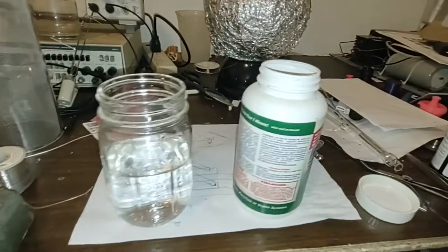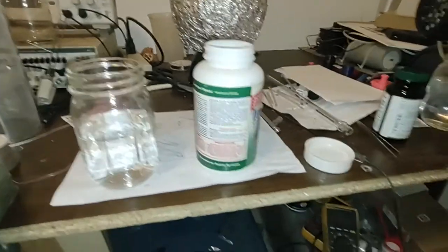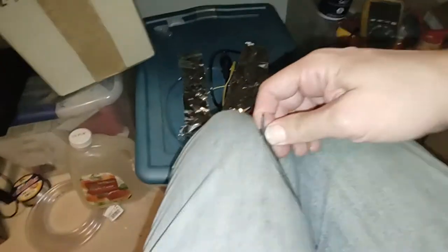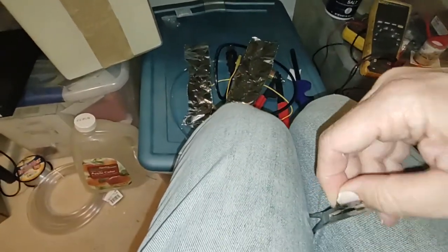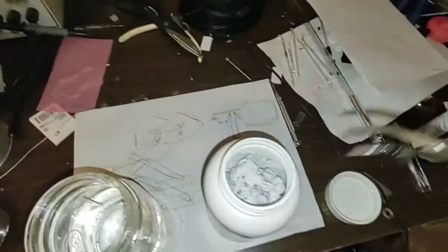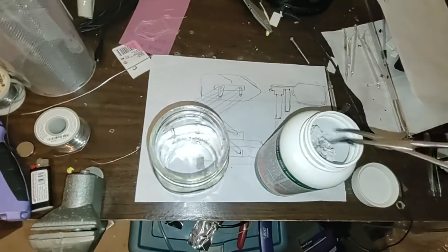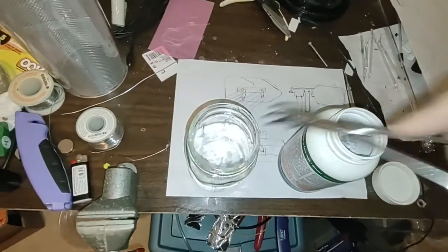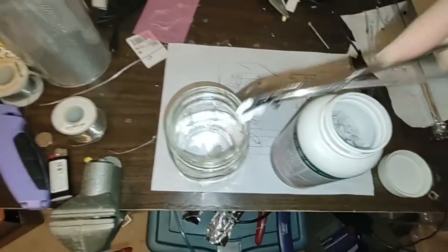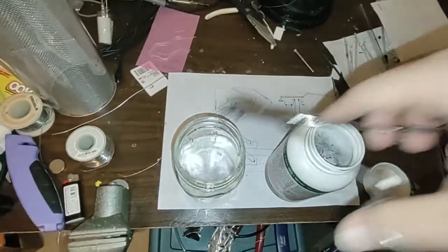Probably shouldn't even handle this with my hands. Got some plastic melted onto this. Let's apply our things here and take a look inside to grab out some sodium hydroxide and stick it in the water. Looks like it's all clumped together. Probably want to use safety goggles — you don't want to splash this stuff in your eyes either. It'll probably burn out your eyes.